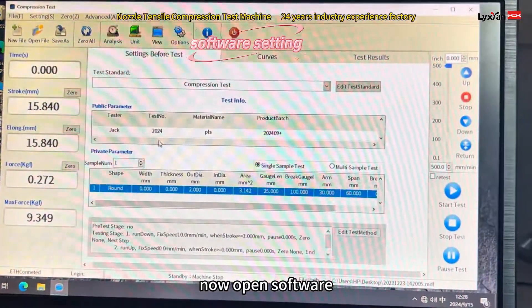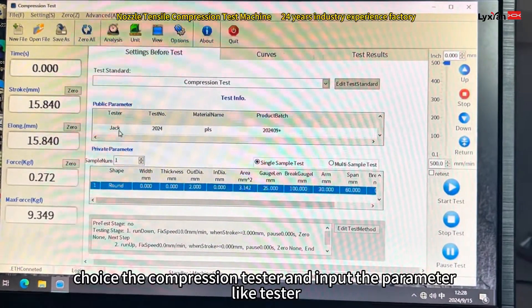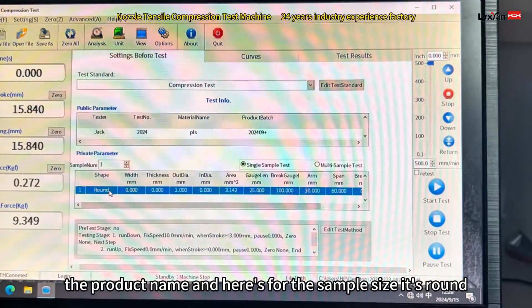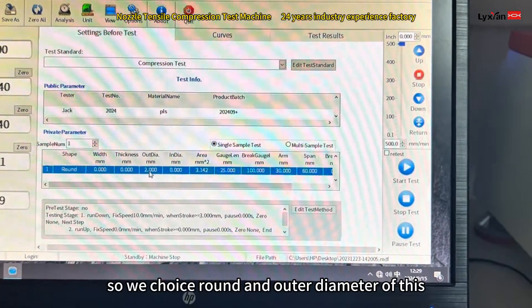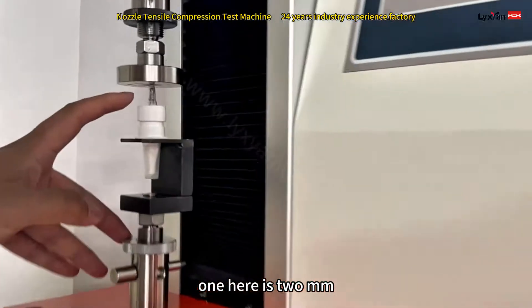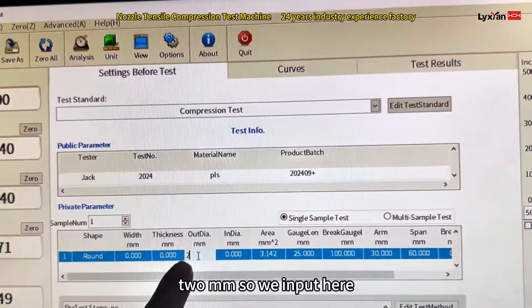Open the software and choose the compression tester, then input the parameters like the tester number, testing number, product series, and product name. For the sample size, it's round — a round cycle — so we choose round. The outer diameter of this sample is 2mm, so we input 2mm here.